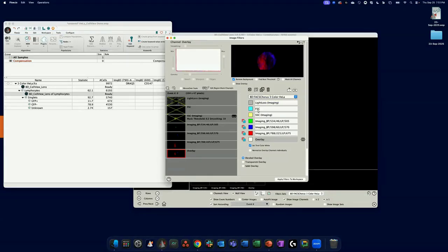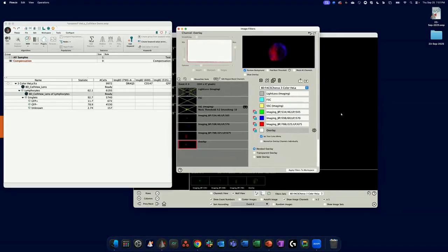You can make new ones. You can also create a copy so you don't have to start from scratch. Okay. So a lot of opportunity here to change the visualization of the cells, right? But keep in mind, at no point are you changing the raw information, right? That raw image-derived signal for how much GFP intensity there is, that's not going to change, right? This is just adding a coloring to that signal just to help with presentation.